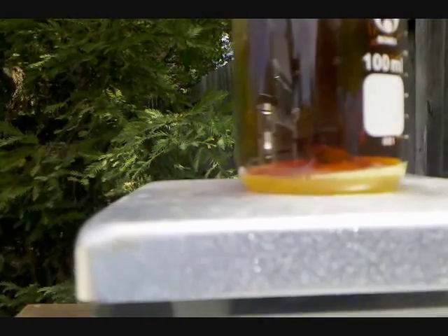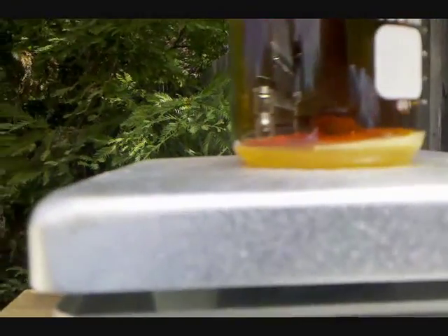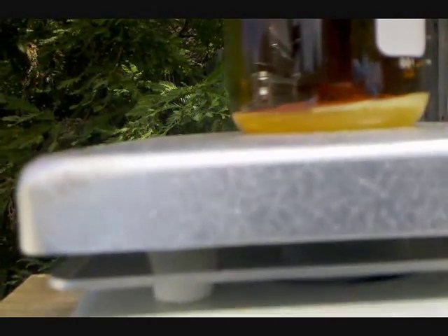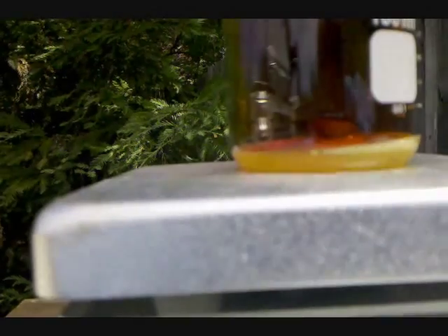So now the reaction looks like it's coming to a stop, with the Bismuth only slightly bubbling. I'll wait for that to finish, and then collect the Bismuth Nitrate.